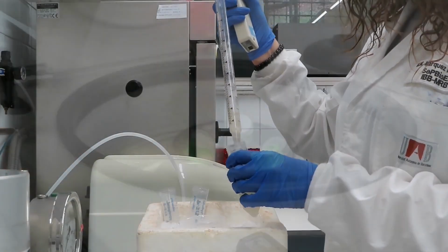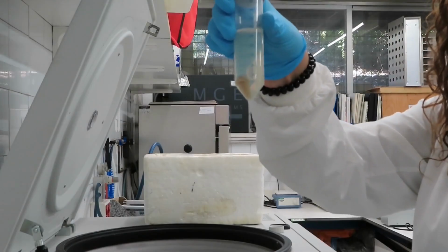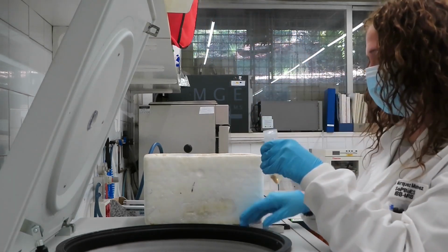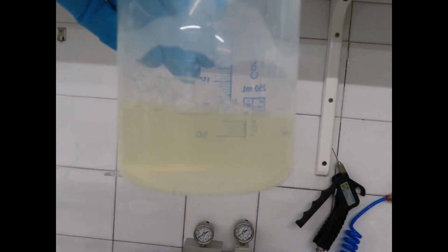Then the cell lysate is centrifuged for 45 minutes at 15,000 g to separate cell debris and insoluble proteins contained in the pellet from soluble proteins present in the supernatant. In this supernatant, a high amount of several soluble proteins is present, and it is necessary to proceed with protein purification to obtain the protein of interest as pure as possible.